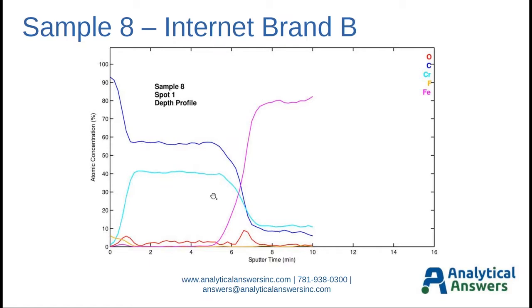And so this chrome carbide layer is another type of hard durable coating, but it's actually unique among all the other samples as they didn't really have carbides. And there was a little bit of oxygen at the interfaces that was picked up by the Auger, but there certainly wasn't any sort of oxide layers.